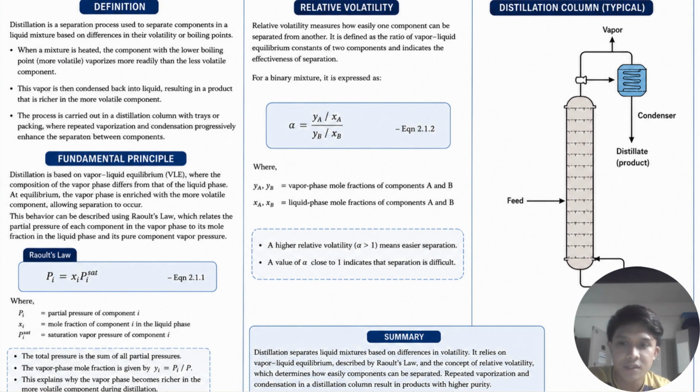In this experiment, distillation is used to separate the ethanol water mixture, and the effectiveness of the separation will later be evaluated using refractive index measurement.